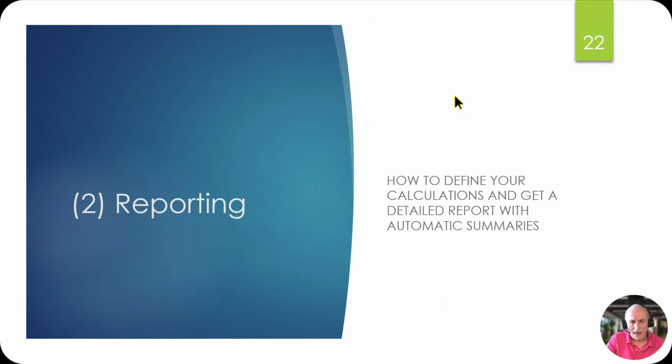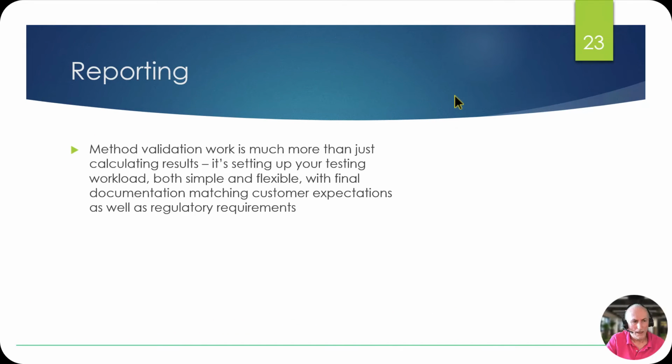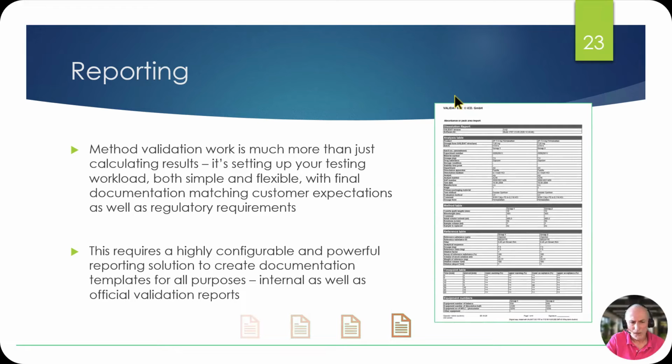Reporting. How to define your calculations and get a detailed report with automatic summaries. Method validation work is much more than just calculating results. It is setting up your testing workload, both simple and flexible, with final documentation matching customer expectations as well as regulatory requirements. This requires a highly configurable and powerful reporting solution to create documentation templates for all purposes, internal as well as official validation reports.